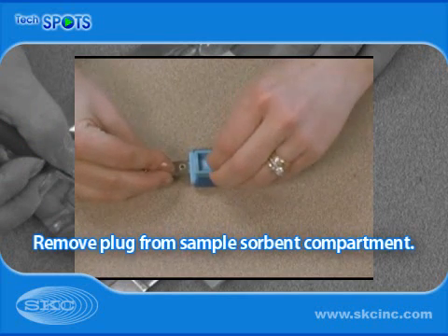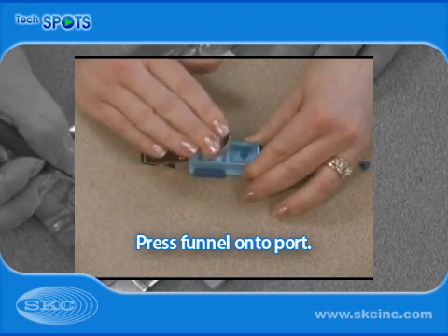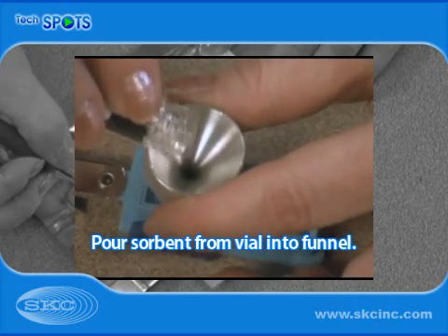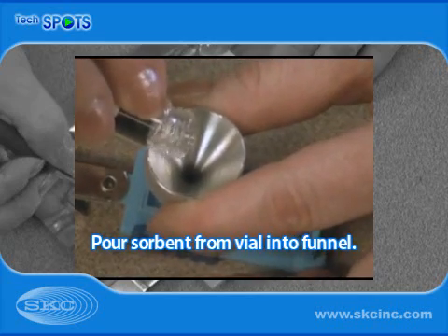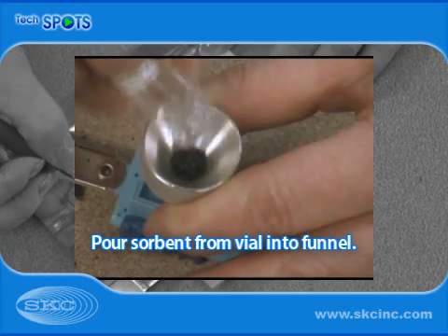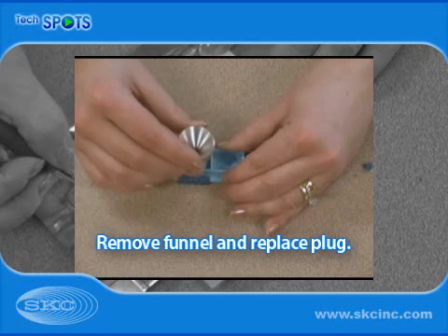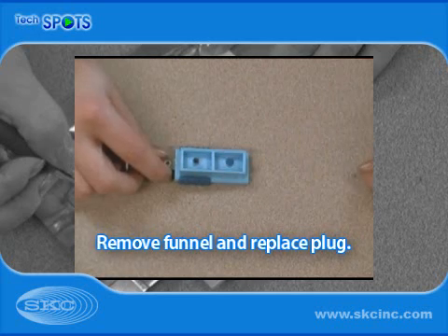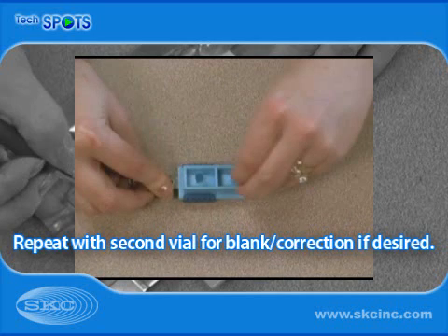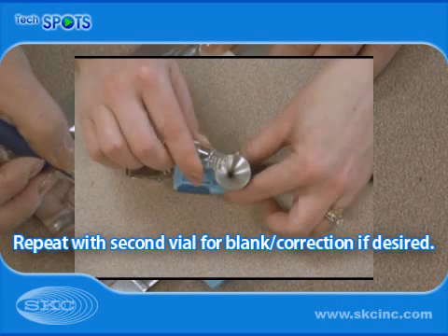If utilizing a user-filled Ultra-3, remove the plug from the sample sorbent compartment. Align the funnel over the port and press down firmly. Slowly pour small amounts of sorbent into the funnel, tapping as you go to facilitate filling. When all sorbent has been transferred to the sampler housing, lift off the funnel and replace the plug in the port. Remove the plug from the blank correction compartment port and repeat the filling procedure, if desired.